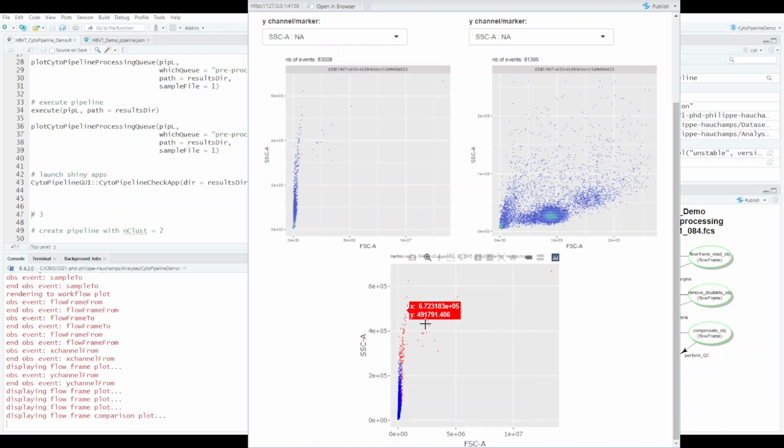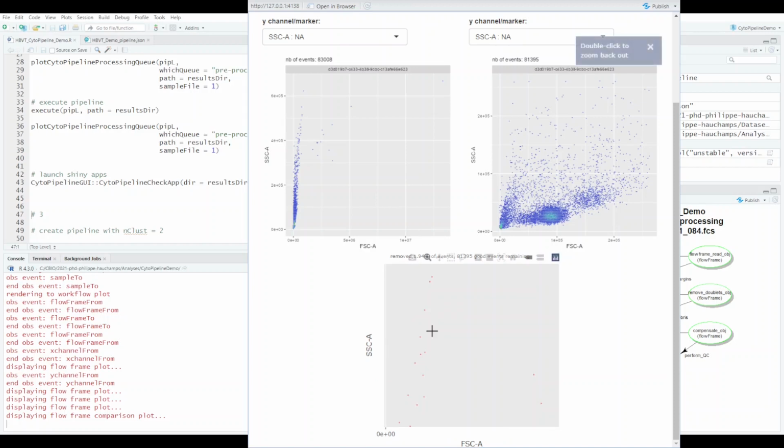What we can do is use the interactive Plotly functionality, so we can see interactively the coordinates of the different points that we select. You can also zoom in using the mouse and so on. So this is Plotly, which can be handy if we want to dig into the values and look at the values that are read, for example. Okay, so this step seems to do its job correctly, because basically we eliminate the values that are far out, outside the range of the instrument.